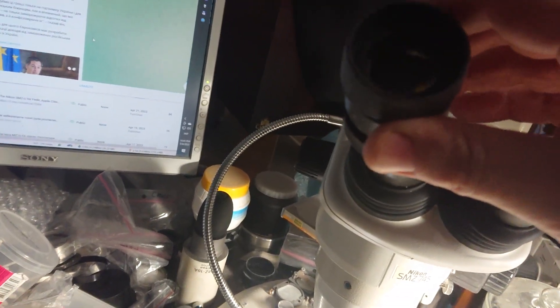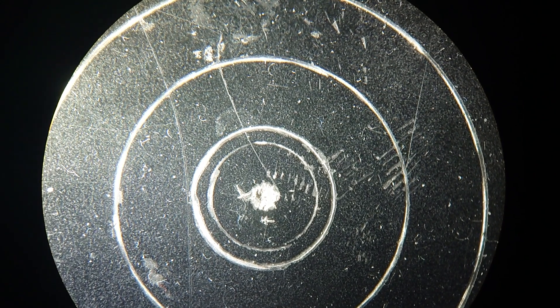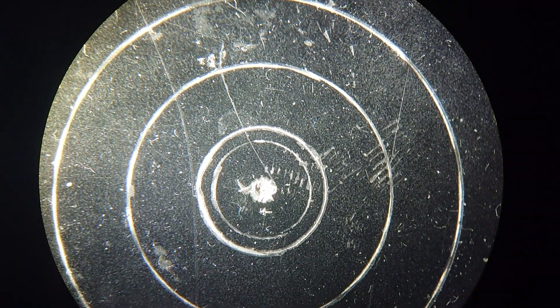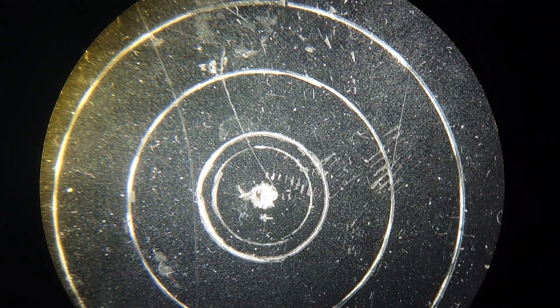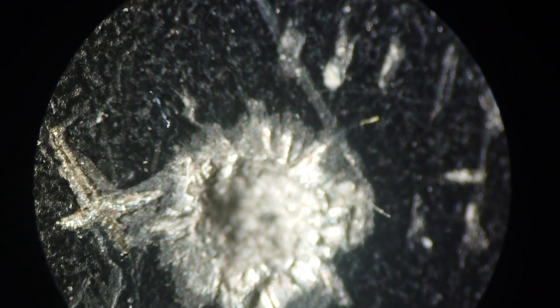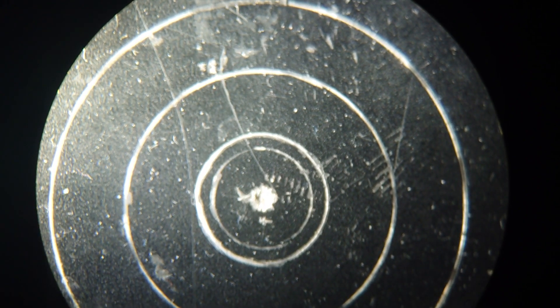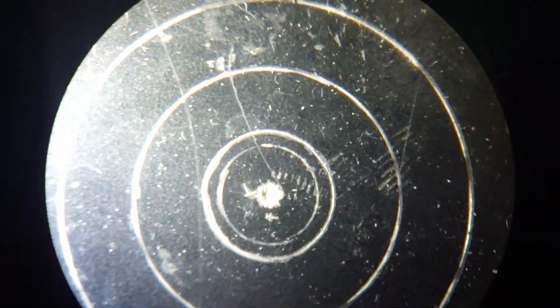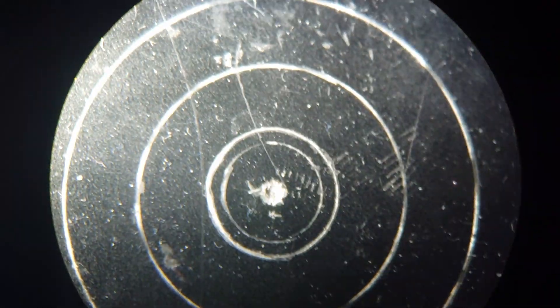Now let's switch to the left channel. You can obviously see that the field of view is shifted — the concentric circles are moved to the left bottom position. When I zoom, the center position is a bit moved aside. The focus also looks like it's been strongly set. I just noticed a strange streak to the left when I make a zoom — let's check it.